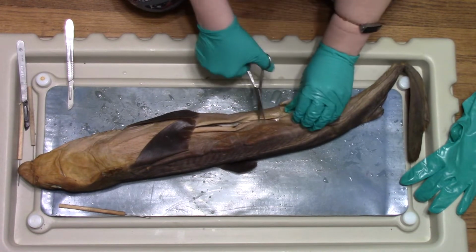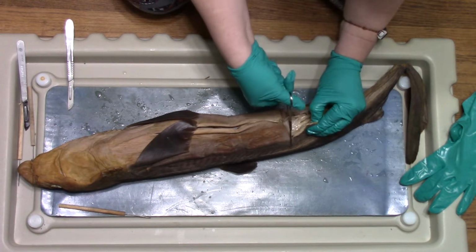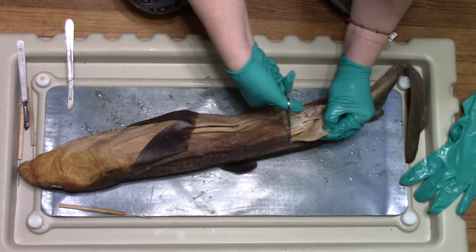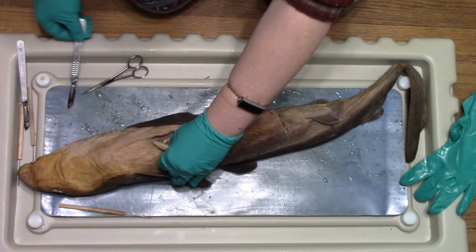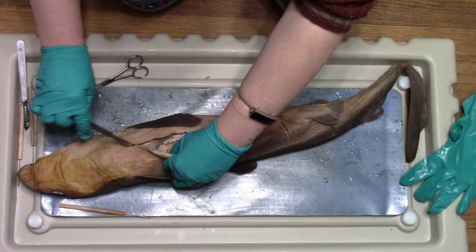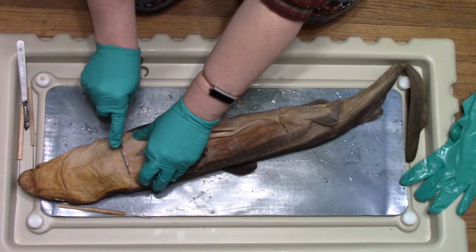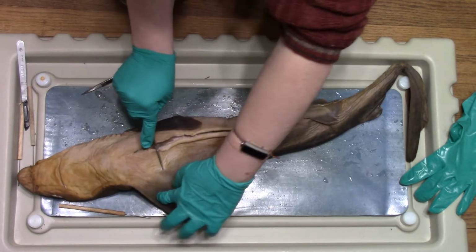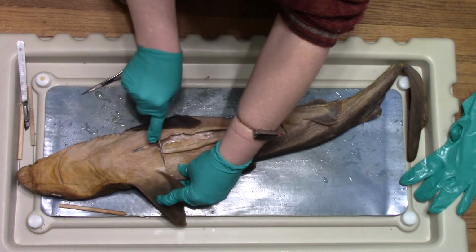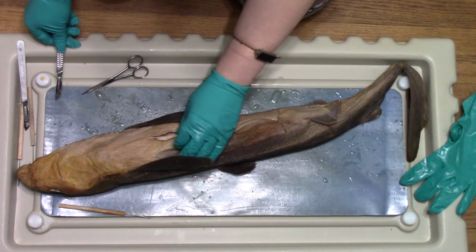But you can see the thick layer of dermis and muscle tissue on the outside. And then you want to extend this all the way up. Again, you usually do it here. This is where you should do it, underneath. Do a cut underneath. Maybe I'll just use the scissors.